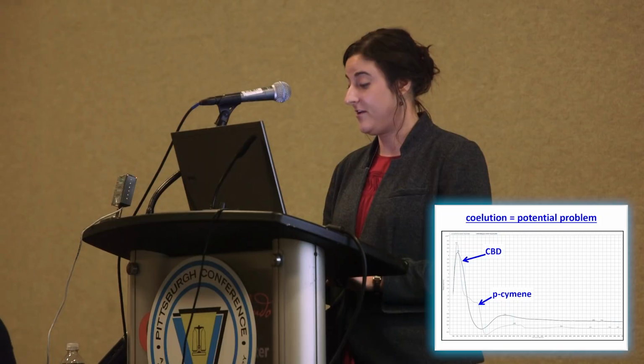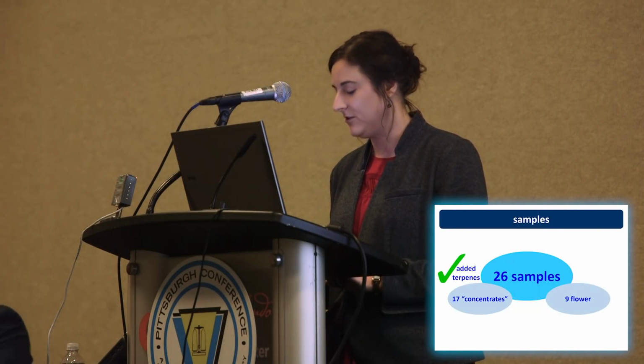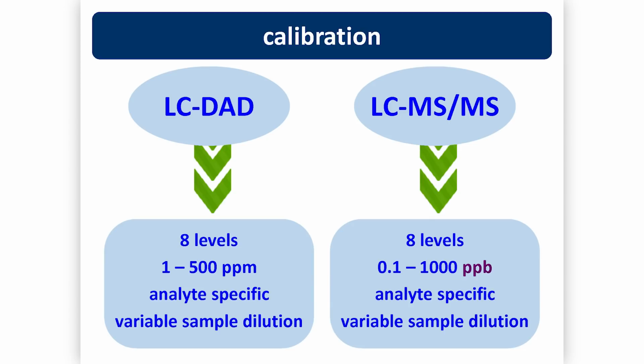So once I wrapped my head around that, we decided to look at some samples. We looked at 26: 17 of what I'm calling concentrates, basically non-flower, and 9 flower samples. And we do know that some of the concentrates have added terpenes in them.